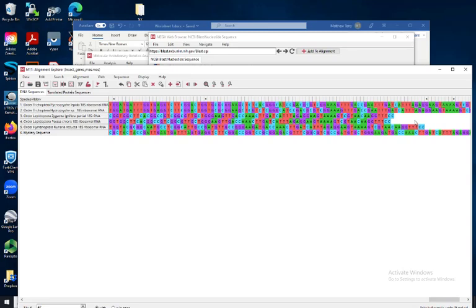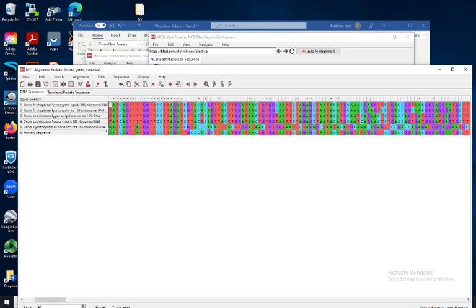So the next step, we're going to try and take care of this difference that has been noted because of insertion and deletion events. And to do that, we need to perform a process called an alignment. So now I'm going to highlight, you can click the top one and hold down Shift, and while you're holding down Shift, click the bottom one.